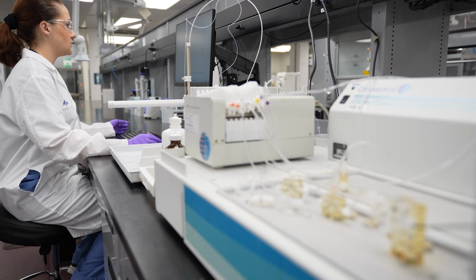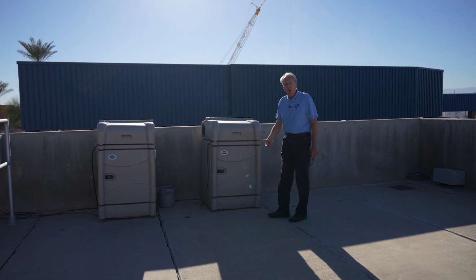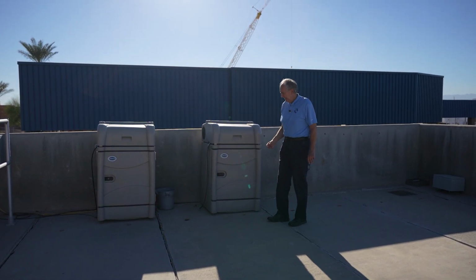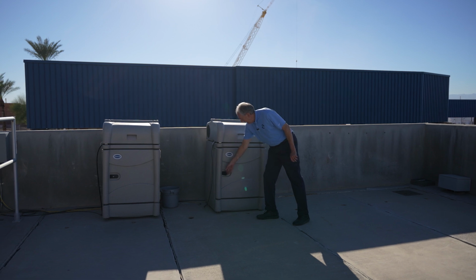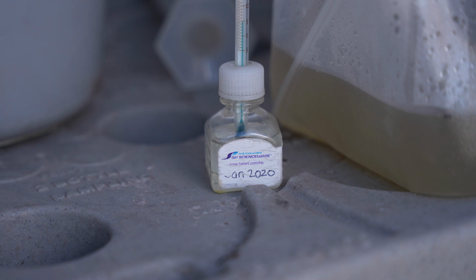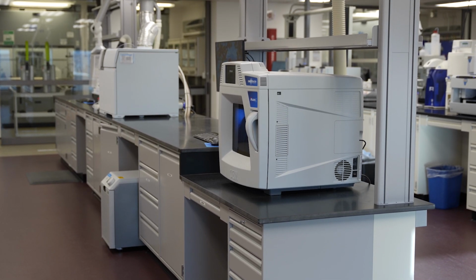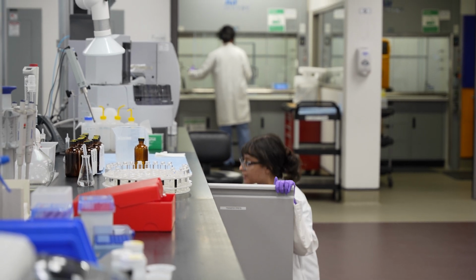in our influent. So these are called composite samplers, and what they do is they draw some of the water that's coming in the plant up into containers and they put them inside. So what we're doing here is we're taking a representative sample of the 115 million gallons that are coming in this plant, putting that sample into a container that can be analyzed at laboratories.